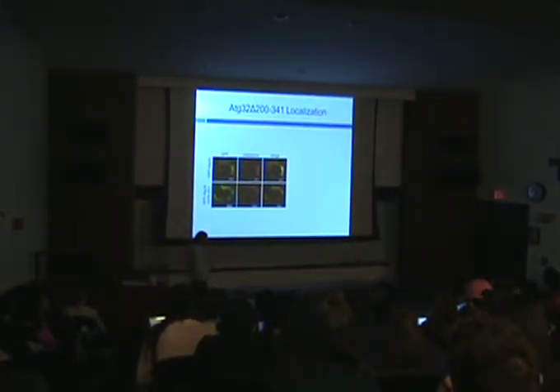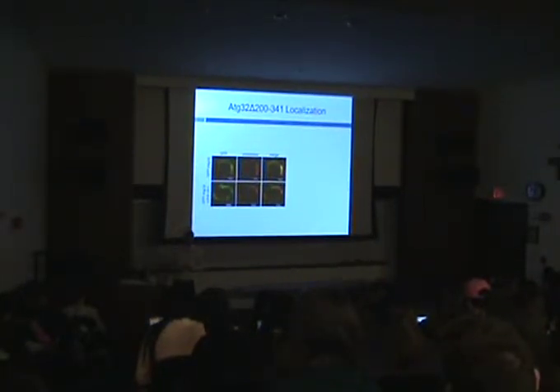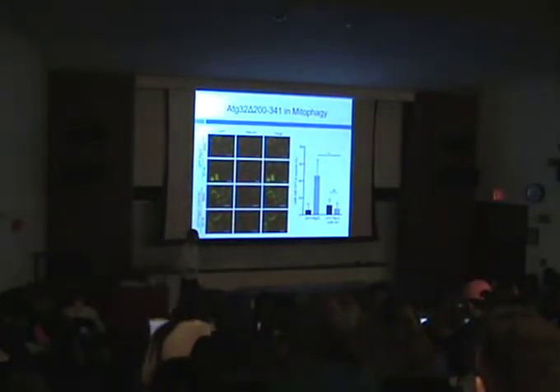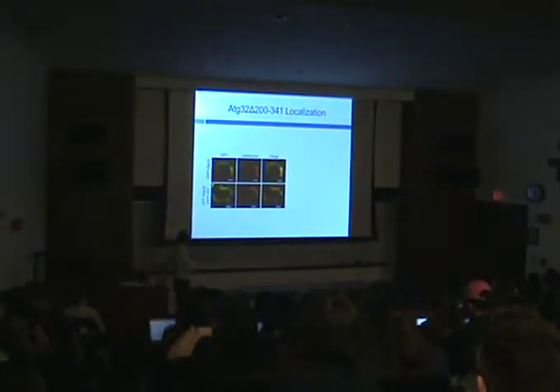Now, of course, we're messing around with the protein. We're changing it from its natural state. So whenever you do that, you could just mess it up. And it might be that the result we're seeing here is really just because we completely destroyed the whole protein. Well, despite that, it still gets quite nicely onto mitochondria.